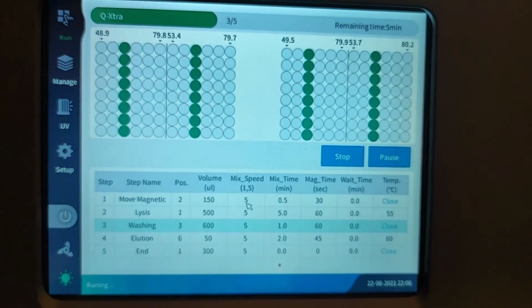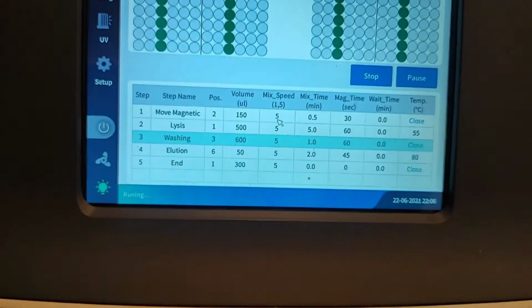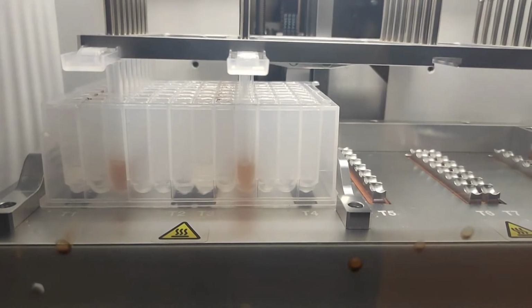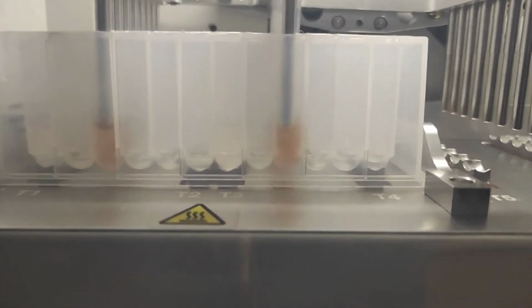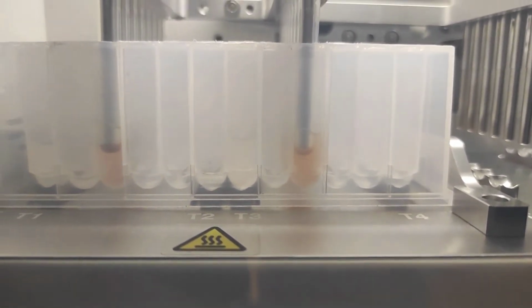Automatic extraction of RNA of COVID-19 samples. Again, the magnetic beads are getting attracted to the comb for the next step, that is elution.